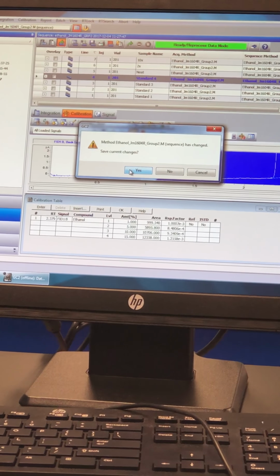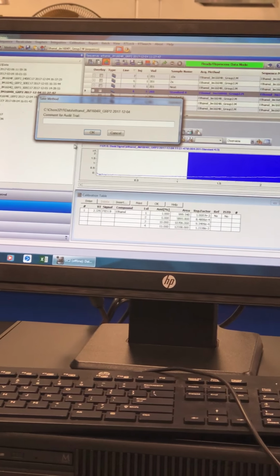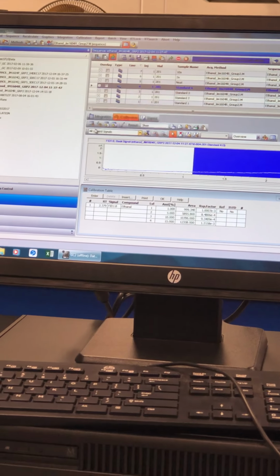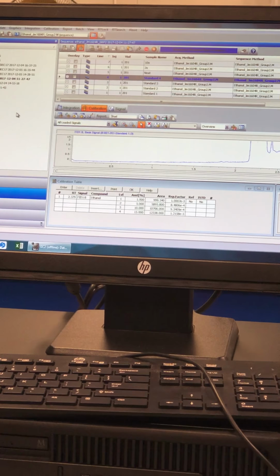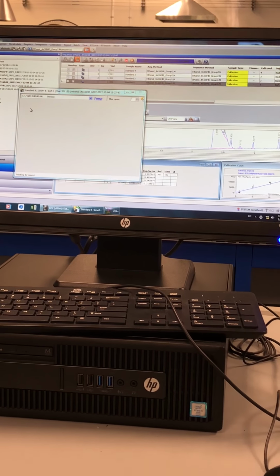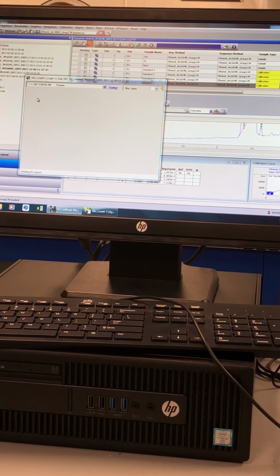Okay, whatever question they ask, just feedback positively. Just reply okay, yes, okay, yes. No need to comment anything. After you start processing, it will be highlighted in blue, and there will be a lot of pop-up windows, like a virus.